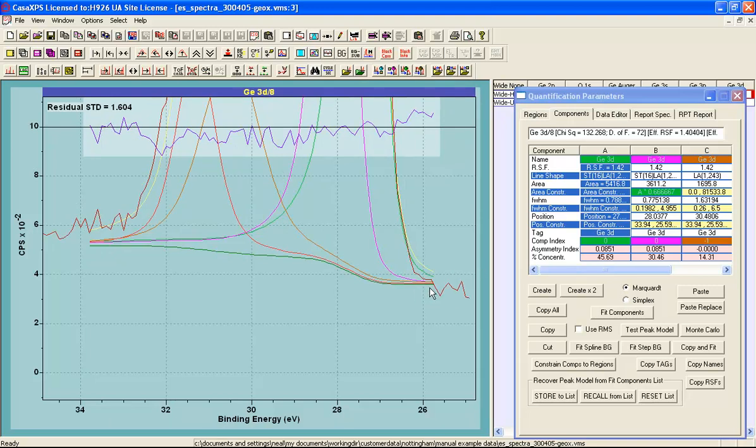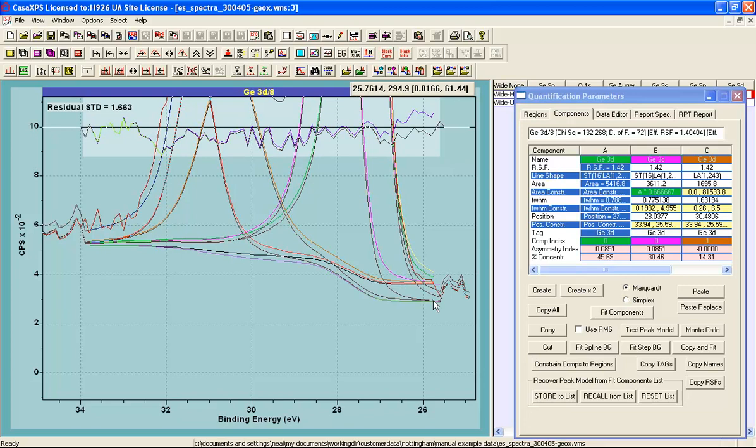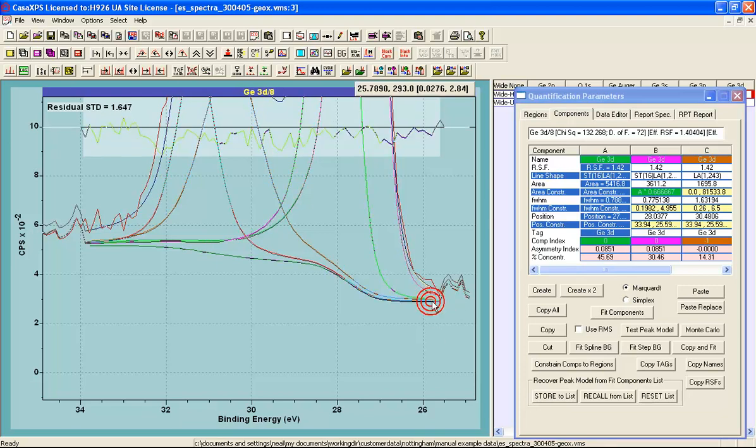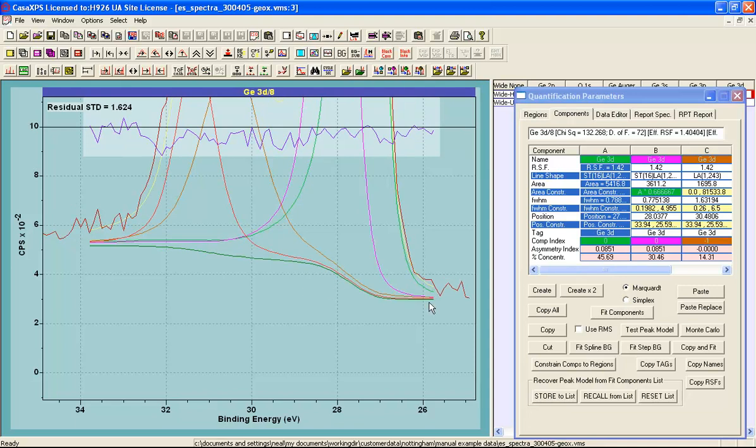And we can do a similar adjustment at the end, and the end is slightly more complicated in the sense that there ought to be an oxygen 2s peak somewhere in this region, and it will interfere with the definition of this background. So there's a certain element of guesswork that is inevitable when you have interference of low level, although there must be some oxygen here because we have the oxide peak. So the adjustments of the background are significant to the definition of this peak model, and they are complicated by the nature of these types of data.